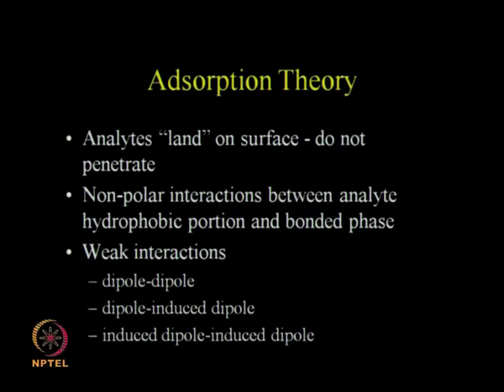Bonded phase means you may have a C18 or a C8 or C3, different types of hydrocarbons bonded to the solid polymeric matrix. So there is a non-polar interaction between the hydrophobic portion of the analyte and the bonded phase. These interactions could be dipole-dipole, dipole-induced dipole, induced dipole-induced dipole and so on. So all the weak interactive forces are operating here.